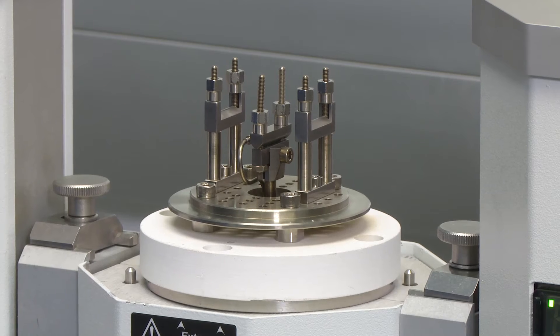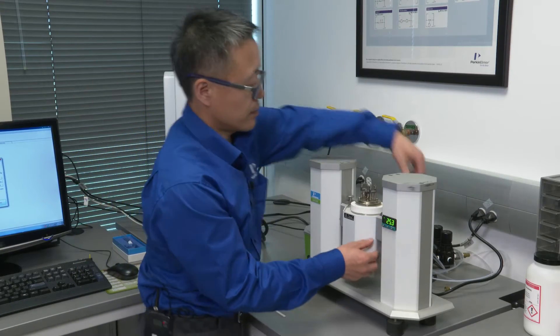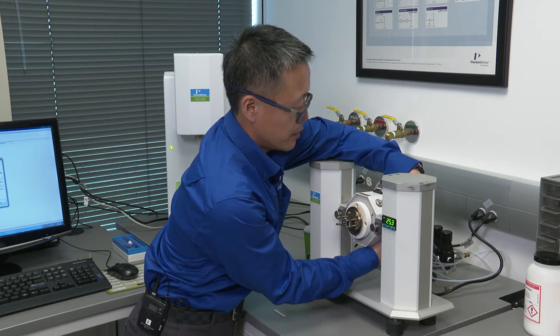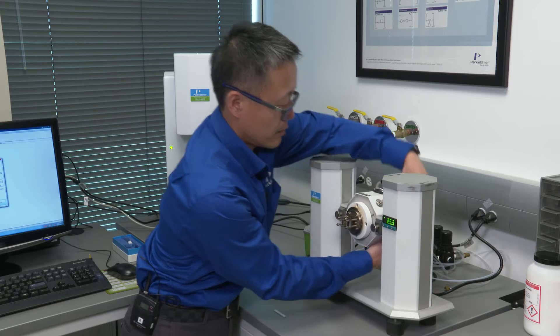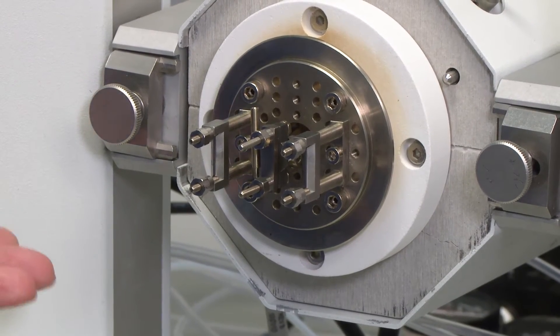Now the center knife is installed. Then you need to turn this to the horizontal position and calibrate the probe position.